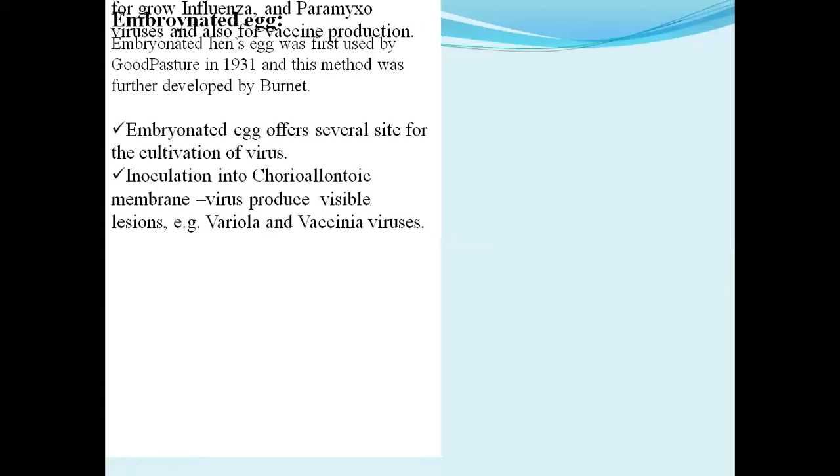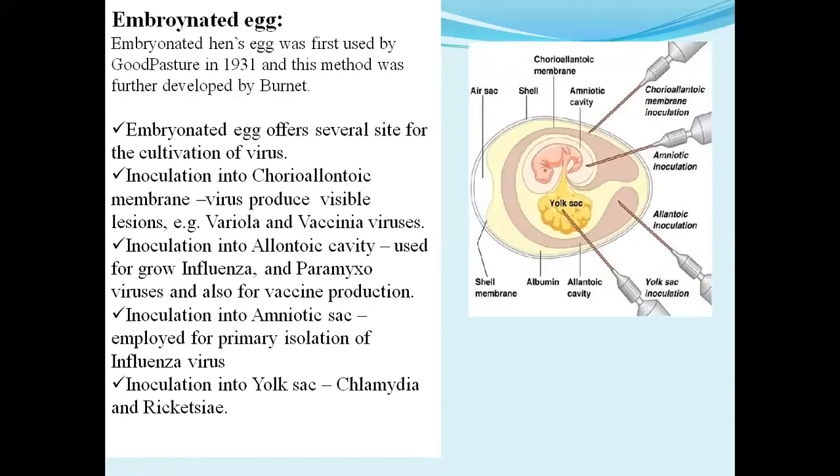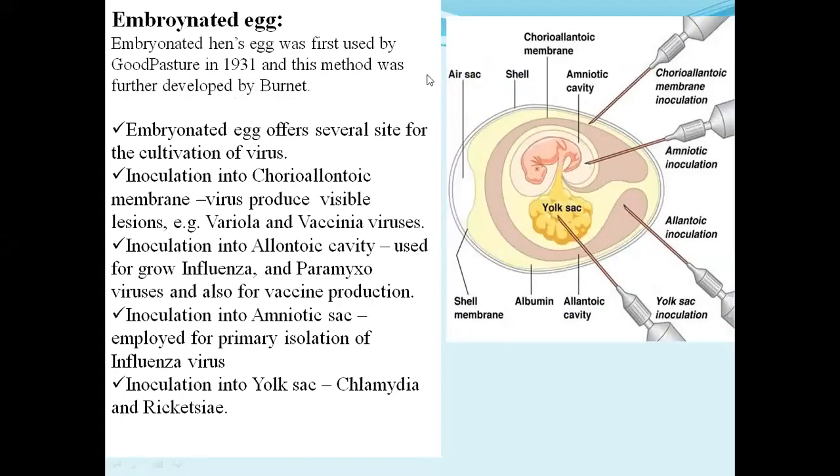Next comes the embryonated egg. Animate media means living media, living cell culture media.